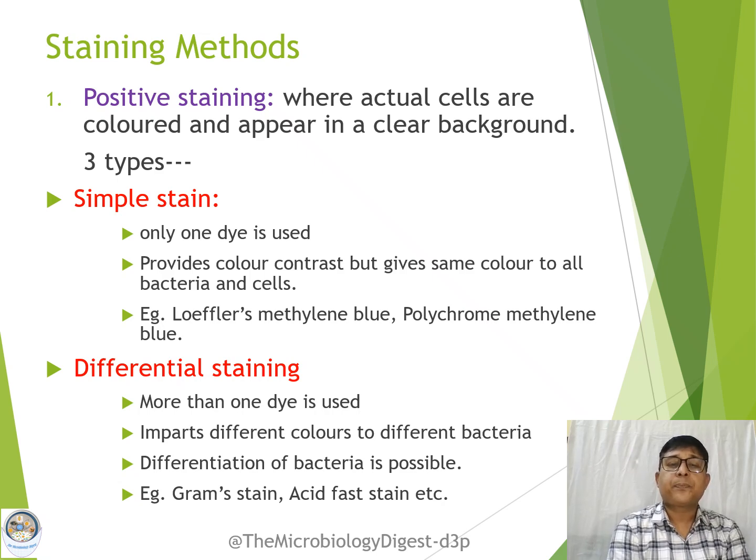Examples are Loeffler's methylene blue and polychrome methylene blue. The organisms uniformly take up the color of the stain, and they can be visualized against the clear background.